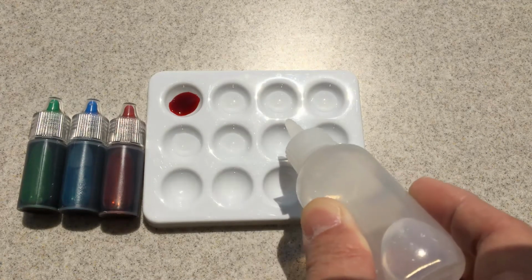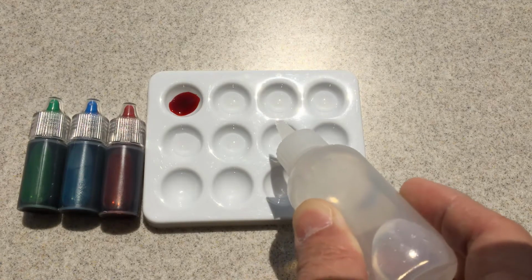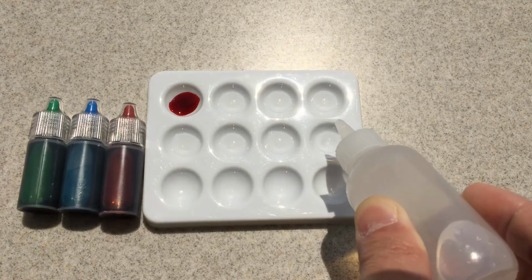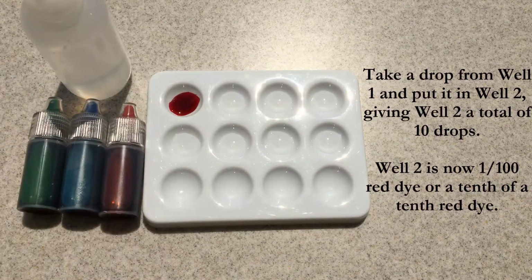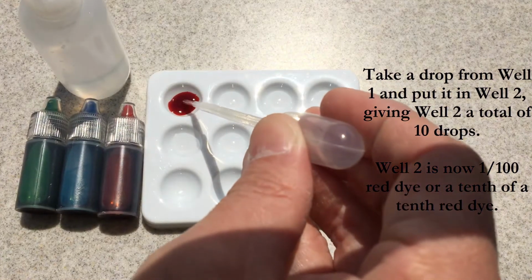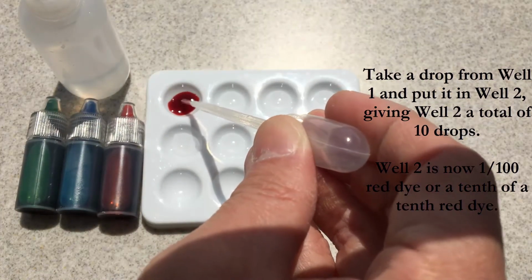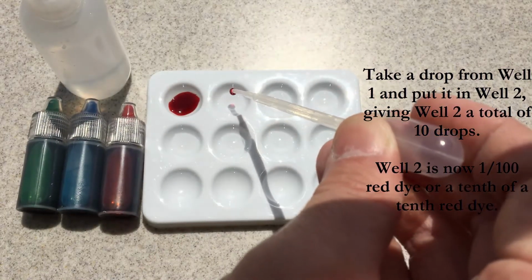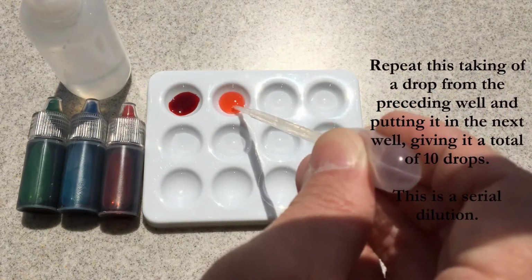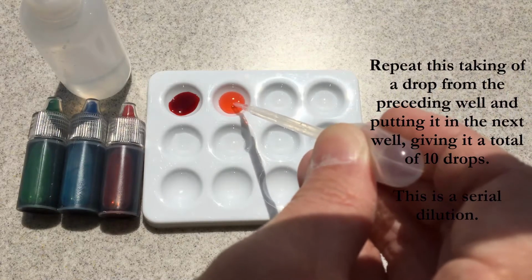After that, we're going to take a pipette, mix the first well, and extract 1 drop and move it to the next well. Once in the next well, anything that was left over we will put back into well 1, but after that we'll go ahead and mix well 2, extract 1 drop from it, move it to well 3.